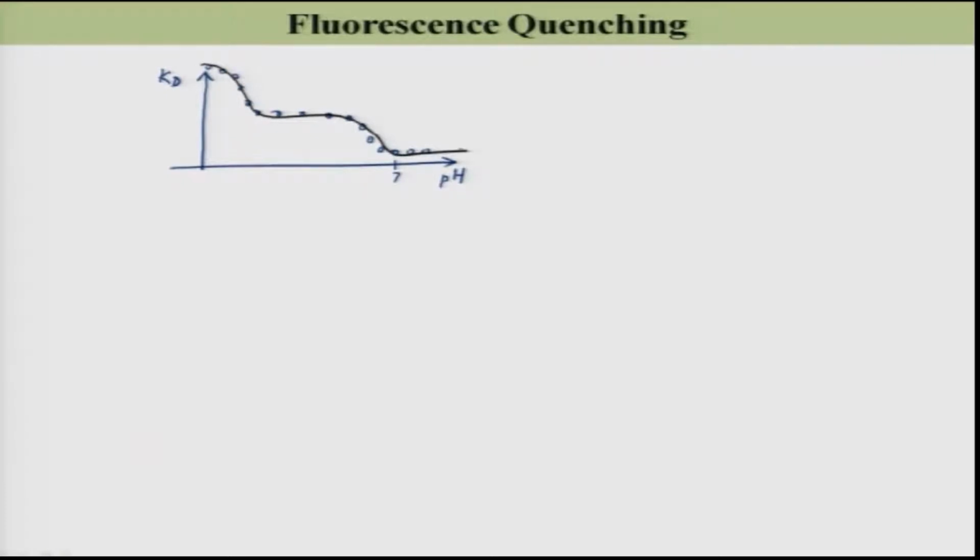It clearly tells you that when your perturbation is this pH, then the change of Kd is two-step. Here is transition number 1 and here is your transition number 2. If I assign this, you can do so, no? Assignment.